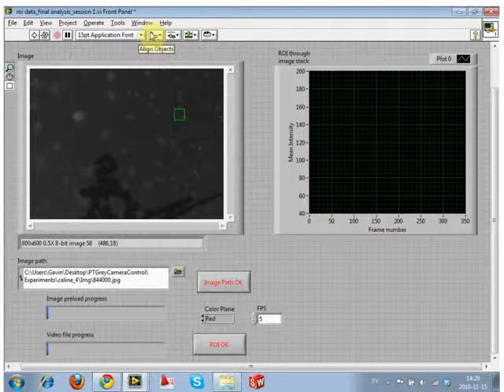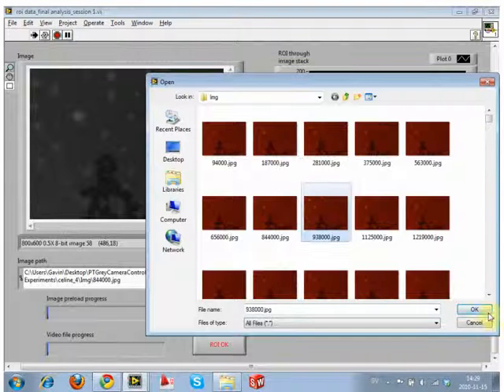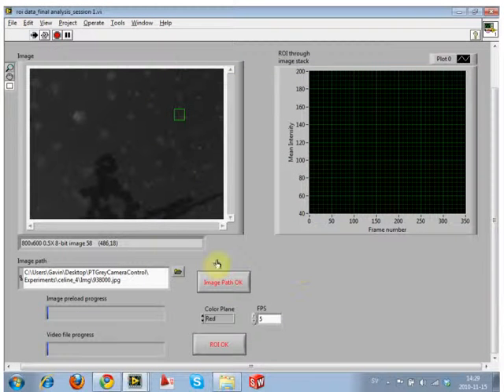So now we free run it. If we run now, and we choose, whatever, pick an image. There, there was a problem. Now it's working. So it needs some experience. It's a little bit of experience, just a little bit of perseverance. I didn't know where the error was. I had no idea.